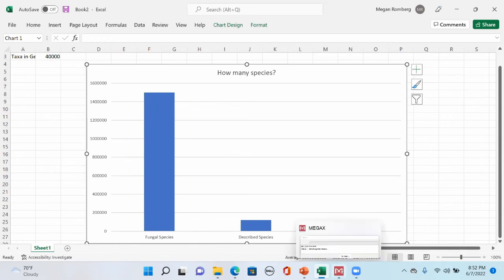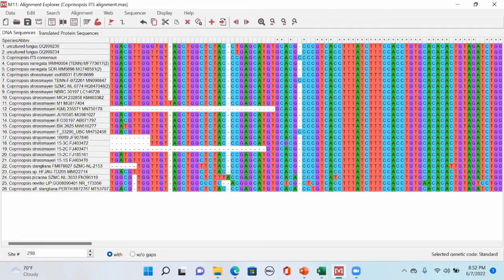Just because you've got a name over here, that's the name whoever was looking at it put on it as a best educated guess. It doesn't necessarily mean that it is truly Straussmerii or truly variegata or whatever. Those names are whatever the person put on in GenBank.